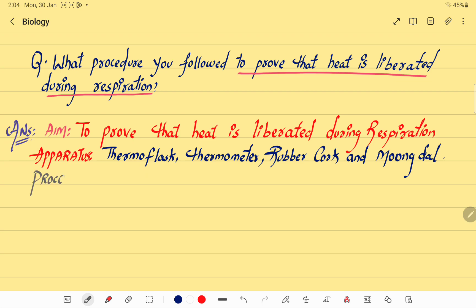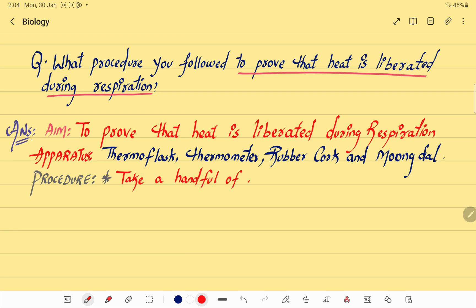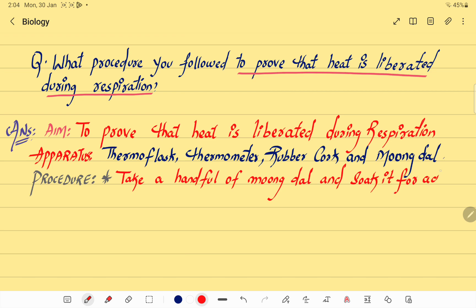Let's see the procedure. First, take a handful of moong dal and soak it for a day.